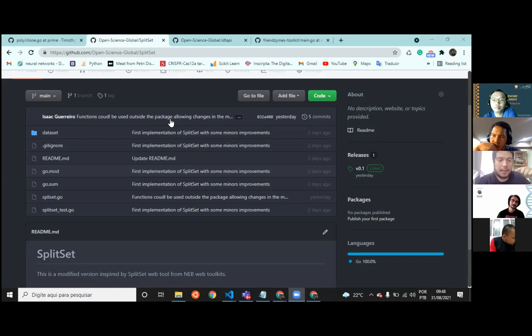So the next step will be taking your sequence and using the restriction enzyme to have the overhangs. Now you have a sample with the plasmid linearized, and you have another plasmid with the OpenInsulin. You take this and put it inside a plate, and put it inside the OpenTron machine, and we run a protocol for making the ligation of both samples. So the process will be, you have some reagents to make the ligation and everything.